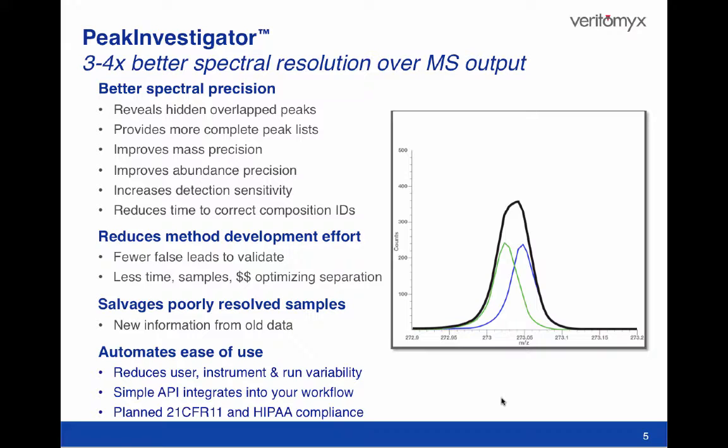The peak detection algorithms automatically adjust to fluctuations in instrument tuning. Baselining and thresholding are fully automated, requiring no user-adjustable parameters. Statistically powered, it is designed for 21 CFR 11 and HIPAA compliance upon commercial release, making it a natural choice for regulated activities.